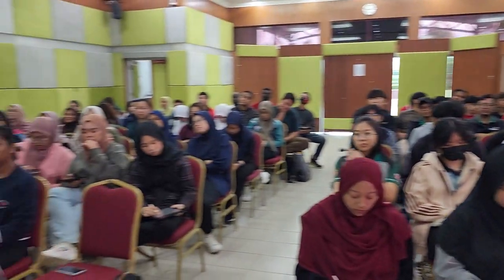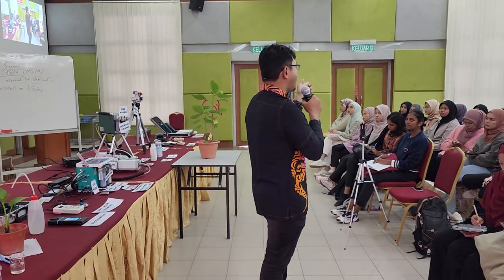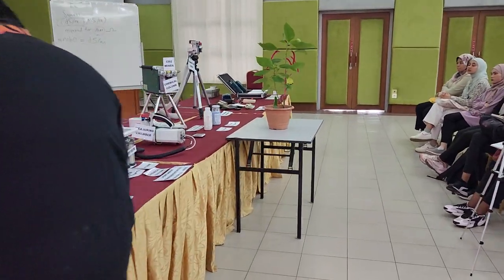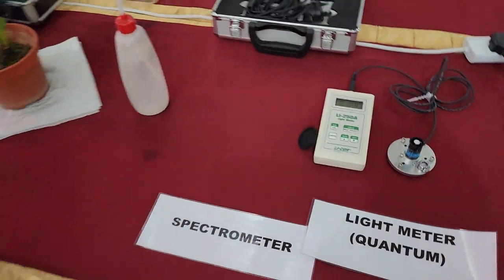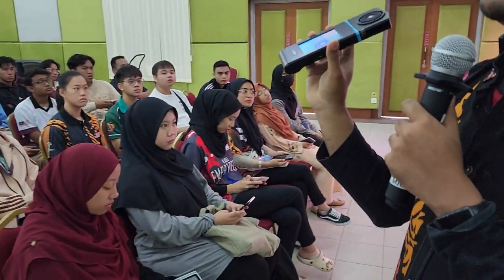So plants utilize the right kind of color and also the right amount of light in order to run photosynthesis. Now I'm going to open this. You see this thing? It's got a sensor on it. Let's try this light. What color is this? White. Is it really white? Yellow.